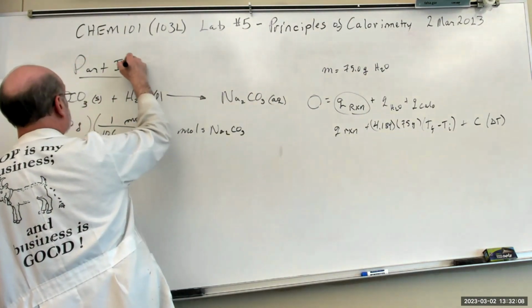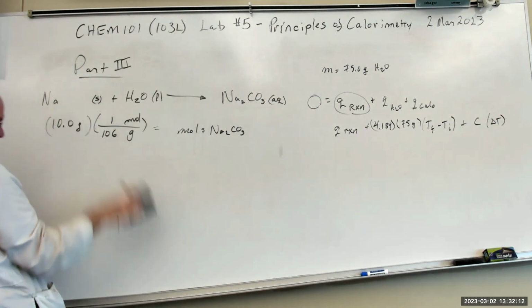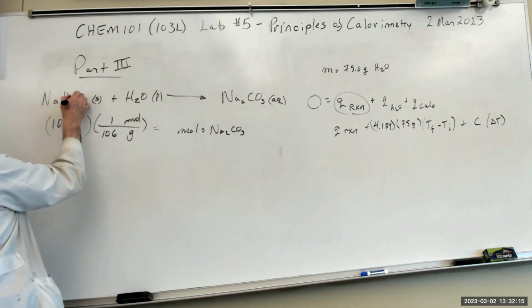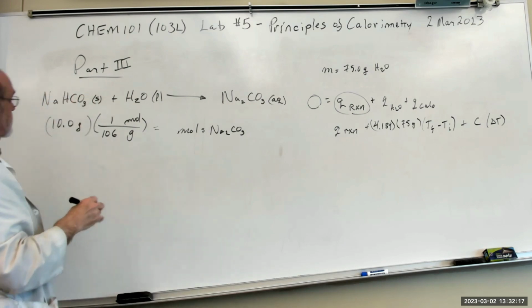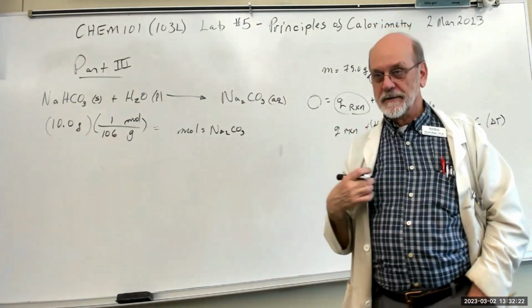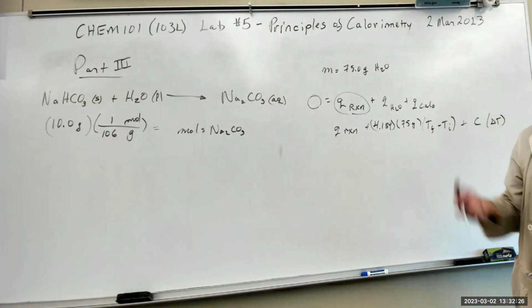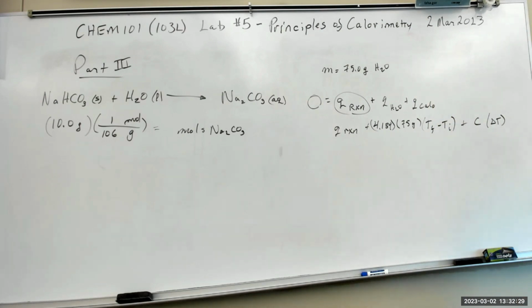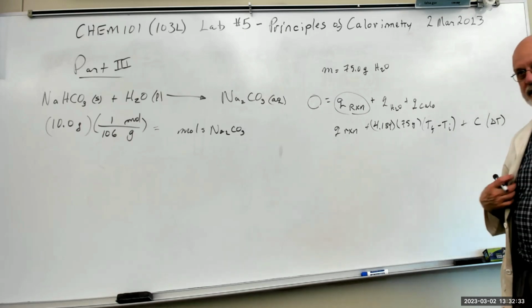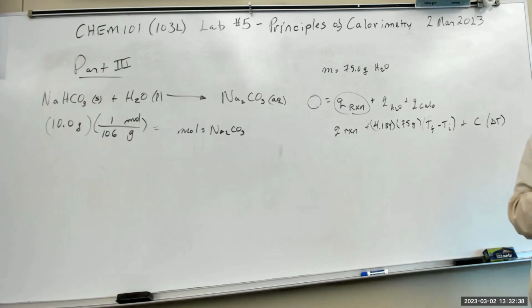Very similar. You'll have this compound, sodium hydrogen carbonate, or as it used to be called, sodium bicarbonate. There was a time when if you had a sour stomach, that was the thing. You just dissolve some of that in water and down it, and it would neutralize the acid in your stomach. Or if you're like my dad, you get up in the middle of the night and grab a handful of crackers and crumble them up in milk. Down that.